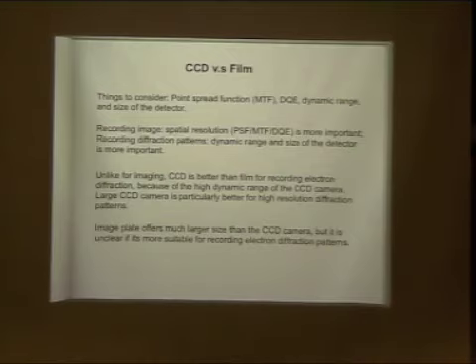But when you process data from both the CCD camera and imaging plates, the statistics in the end are pretty much the same, so you don't gain very much using imaging plates. You have to weed them out, and you have only 56 plates in the microscope. With the CCD camera, it's much more straightforward to see what you get.